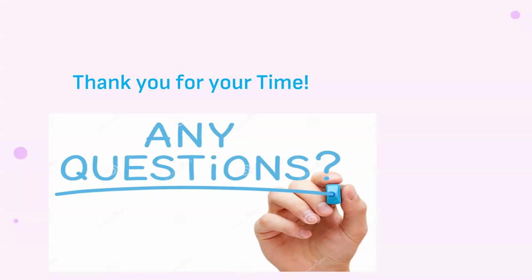But the good thing about the tool is that it takes all types of mutation and then brings out the significant ones. So even if the mutation number is not as large as it ought to be, the tool will still run the simulation, discard the non-significant ones, and pick up the significant ones. I don't know if I've been able to answer your question.